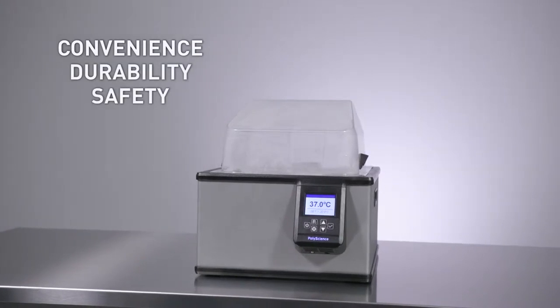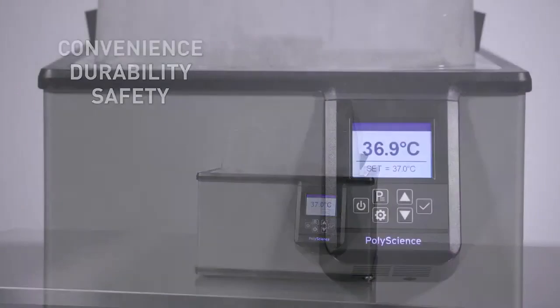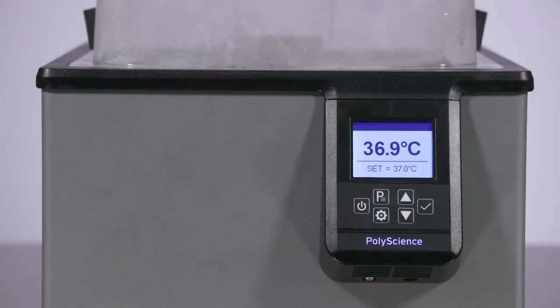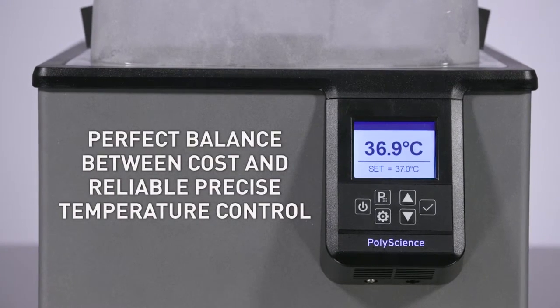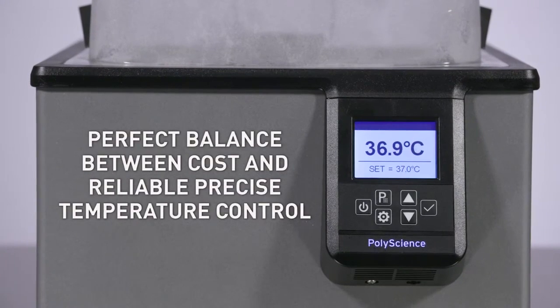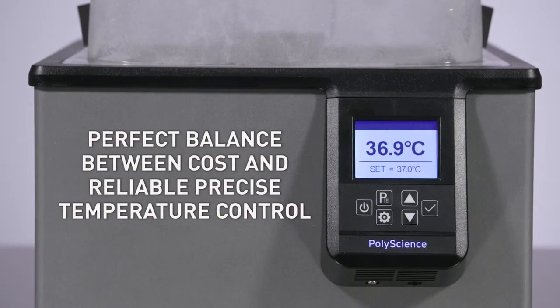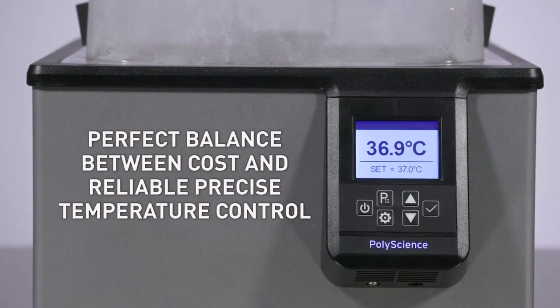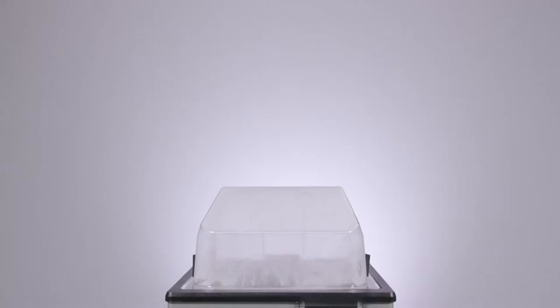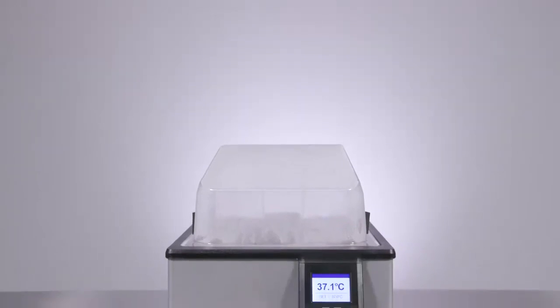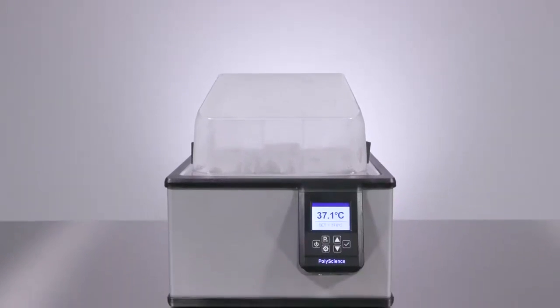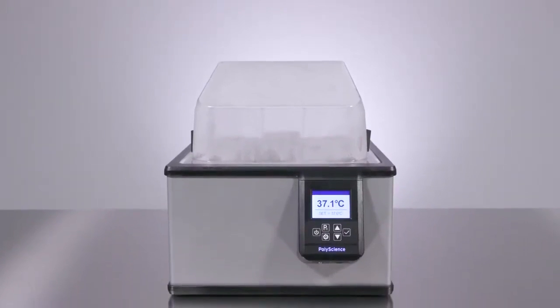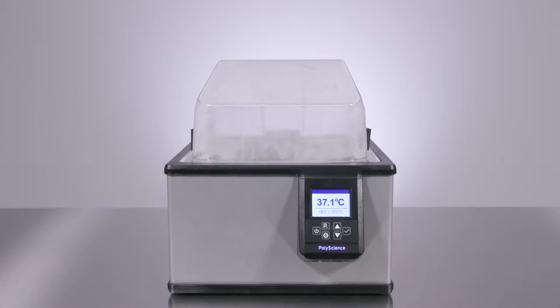Our goal with our water baths has been to strike a perfect balance between cost and reliable precise temperature control, something we have once again achieved with our new generation of PolyScience water baths.